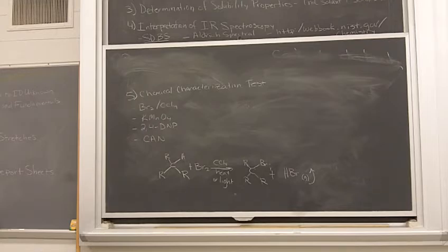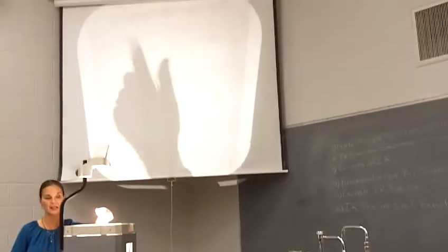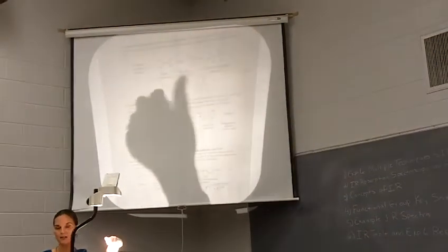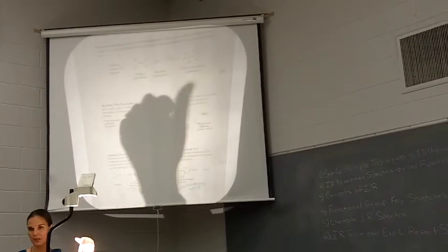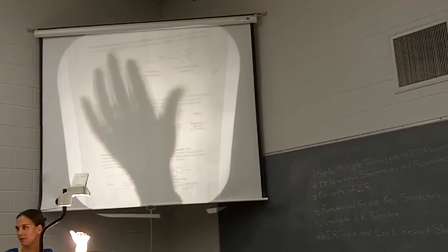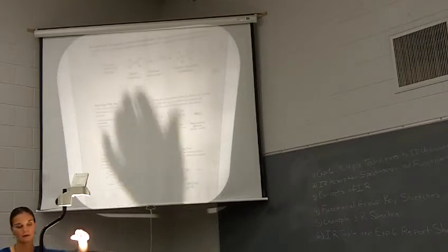And you need both of them to be positive for you to have an alkene, all right? So if you get a positive bromine but a negative permanganate, most likely it's reacting with an alkane, it's not reacting with an alkene, so you'll probably see that pH paper. But if you get a positive bromine and a positive permanganate, most likely it's because it's reacting with the alkene. So you could still see a little bit of acidic pH paper even though it is reacting. So don't use the pH paper as your end-all determinant, all right?